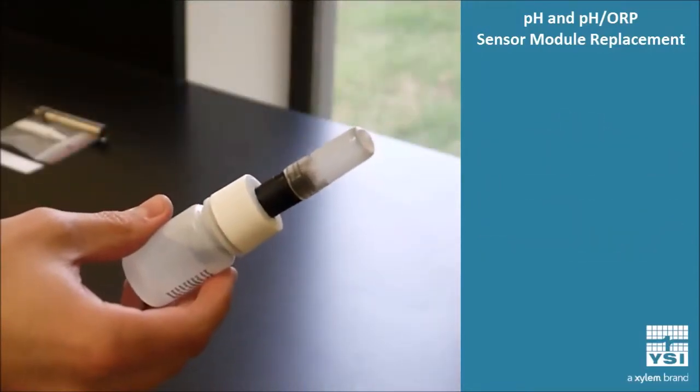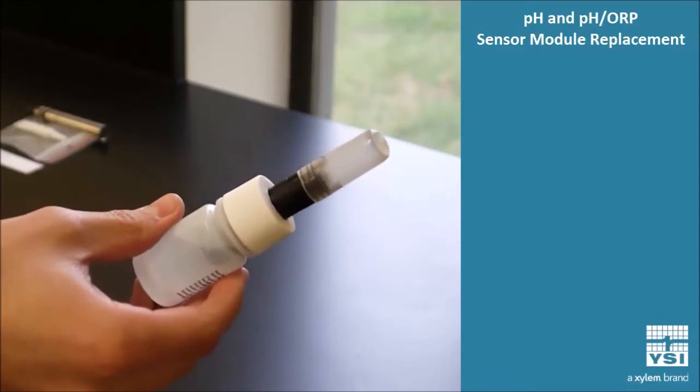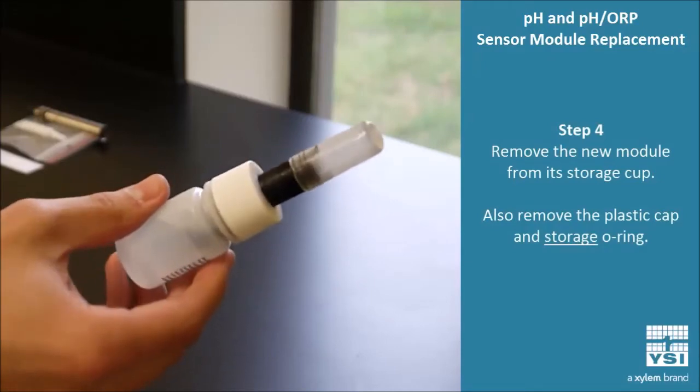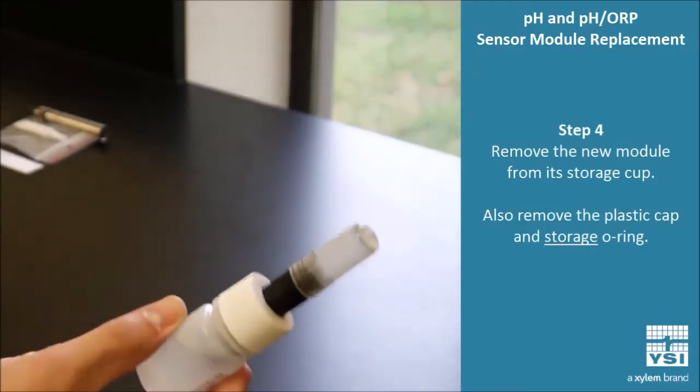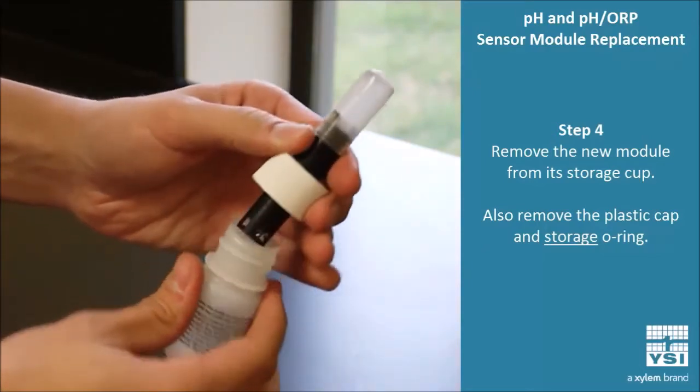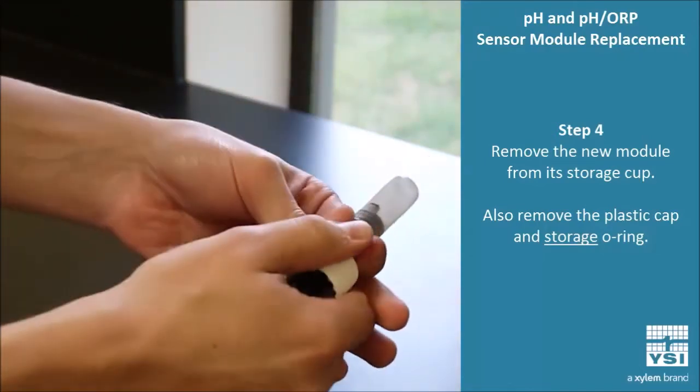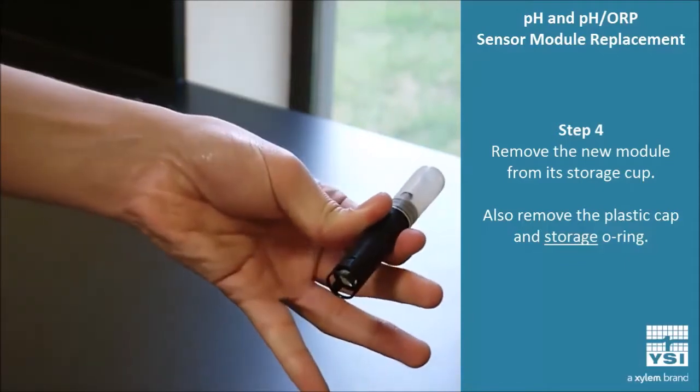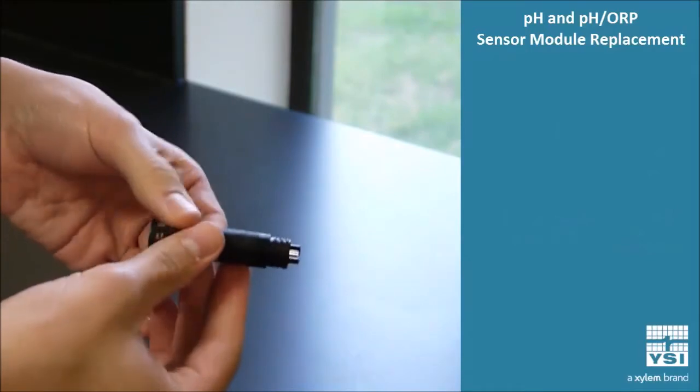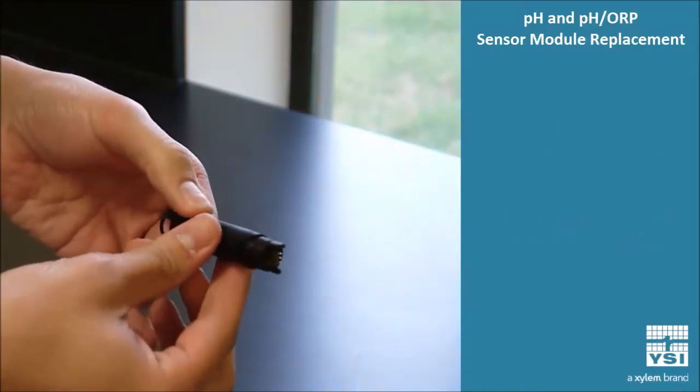Now that we've uninstalled the old module, let's install the new one. Step four is to inspect the new module that came with your kit. It should look something like this. You'll want to remove it from its storage housing. Remove all the caps, all the extras, and you should have something that looks very similar to this.